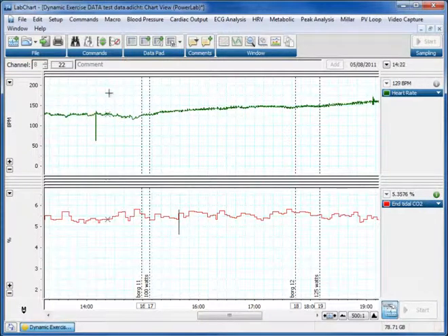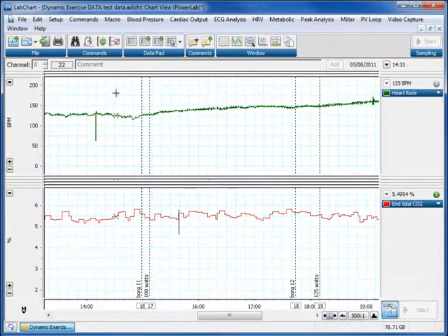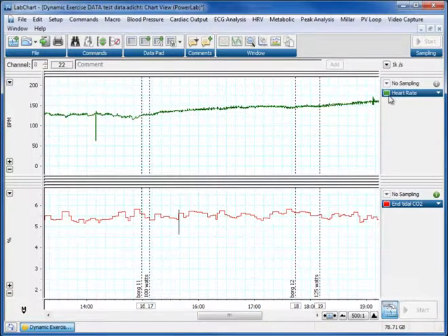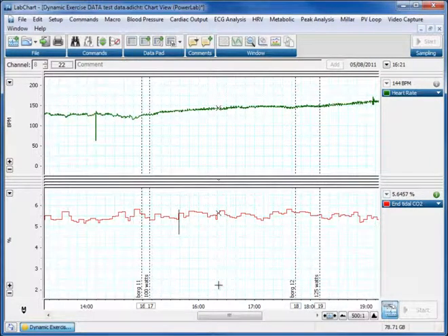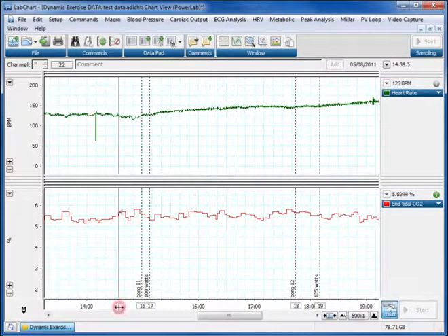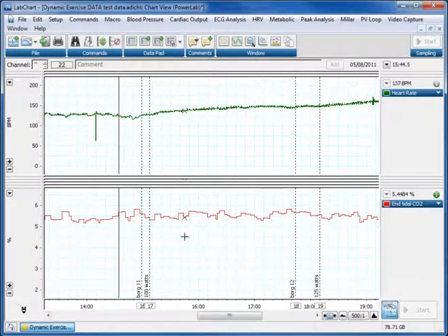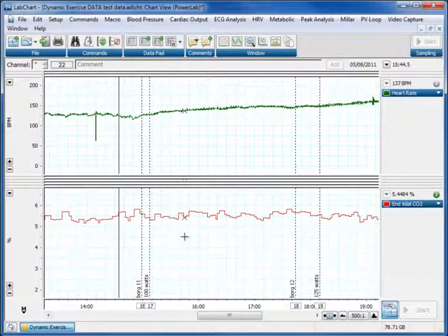The data from within PowerLab itself is very nice, it's very good for analysis, but if you looked at that as a window, it doesn't look very pretty, it doesn't really show off the data particularly well, and certainly we need a lot of fiddling, photoshopping, whatever, to make it look a little bit better.